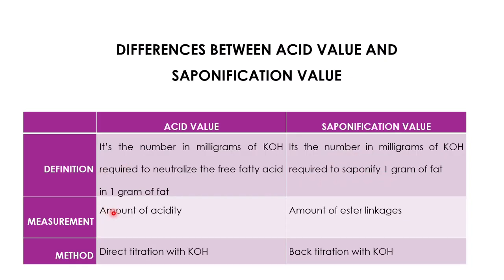In terms of measurement, the acid value measures the amount of acidity, whilst the saponification value measures the amount of ester linkages.